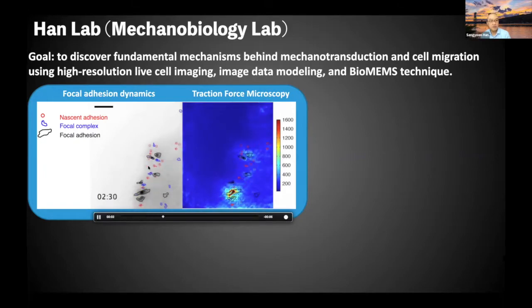And this is the focal adhesion protein called paxillin. From this channel, we segment and detect diffraction-limited spots, and then track them to see if an adhesion is disassembling, turning over, while they are red, or whether they become blue and black to mature.